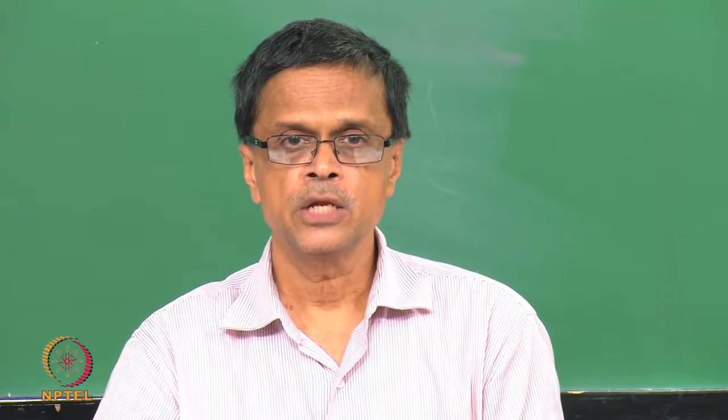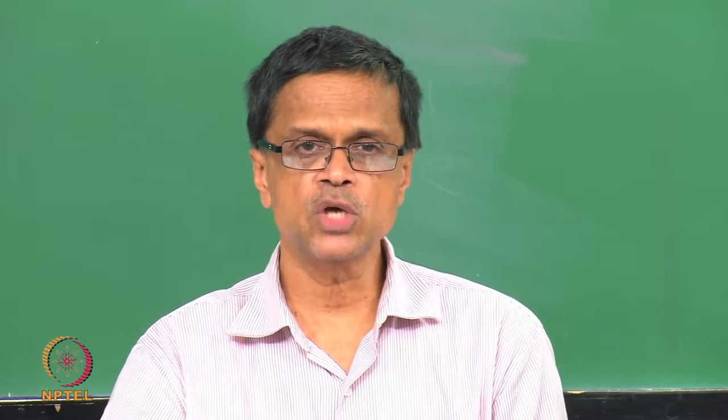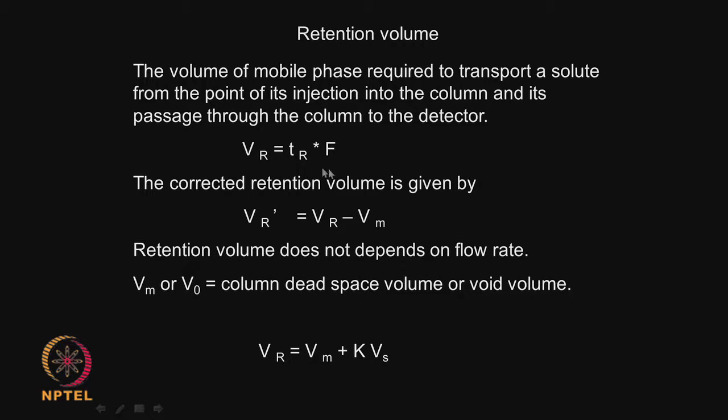Okay. Now, similar to retention time, you also have retention volume. So, retention volume is given by retention time into flow rate, it is obvious, right. So, that is the volume of the mobile phase required to transport that solute from the start, the injection point, right up to the detector point at the end, right.